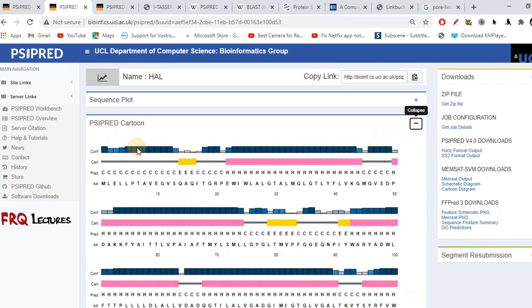Moving to the next section, this is the secondary structure in a more graphical form. It has four different sub-sections. You can see bars of different heights. The same three colors apply: pink for alpha helices, yellow for beta sheets or strands, and gray for coils. A coil connects an alpha helix with a beta sheet. In the alphabetic representation, H is used for alpha helices and C for coils.